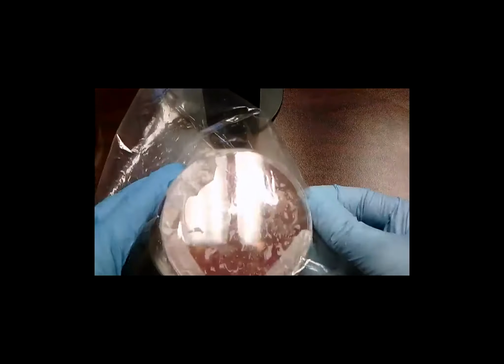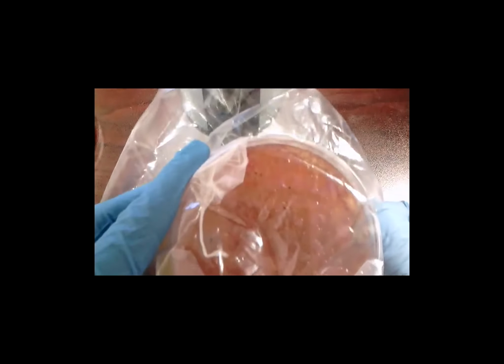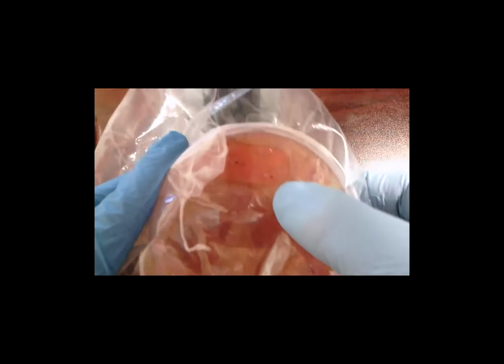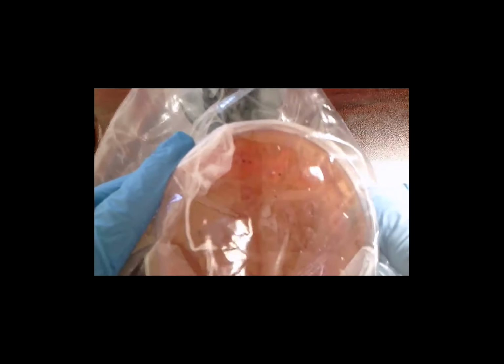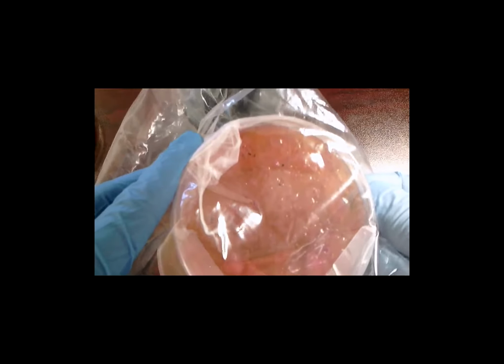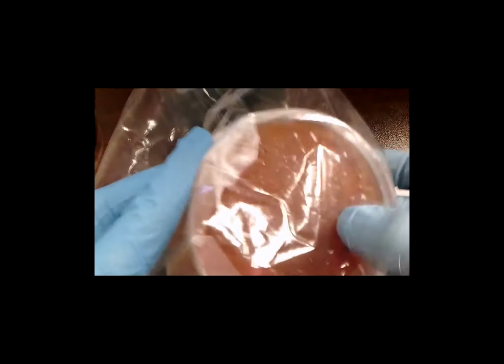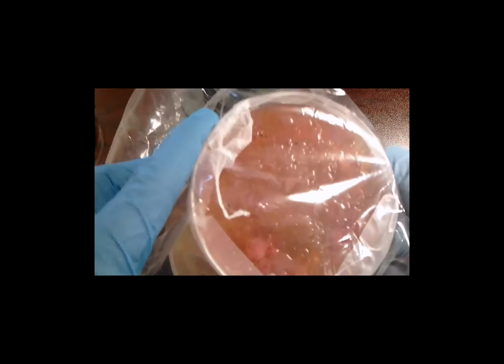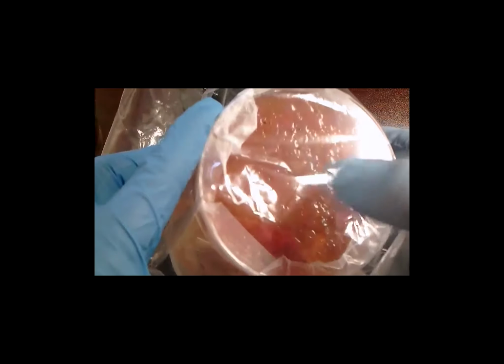So on this MacConkey agar, which is looking for coliforms, can you see the real dark specks on there? The dark specks, like one by my thumb there, those are coliforms or E. coli bacteria. If you were here, you would probably have a better view of it, and they're pink and purple. So when the students are counting bacteria on the MacConkey agar, the purple agar, pink agar, they're going to be only counting the coliforms or the E. coli, those bacteria colonies that are pink and purple. They're not worried about all this other clear colonies.